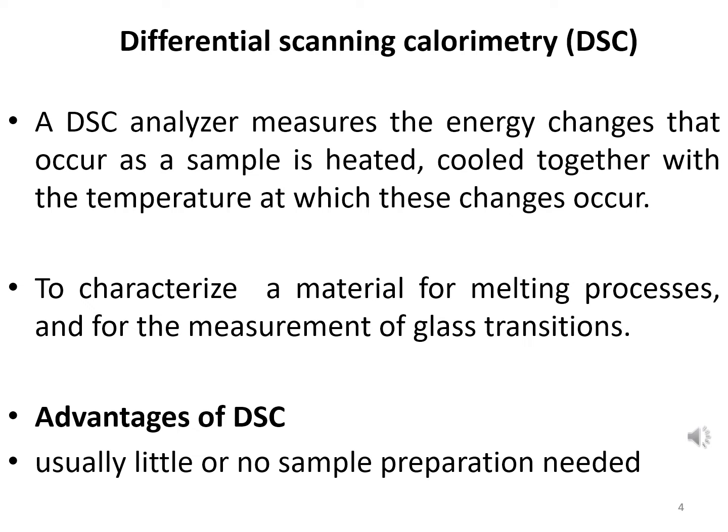These energy or heat changes enable the user to find and measure the transitions that may occur in the sample, and they can also note the temperature where these transitions occur. And so one can characterize the material for its melting processes and also for the measurement of glass transitions.